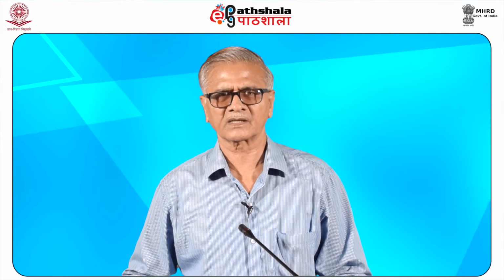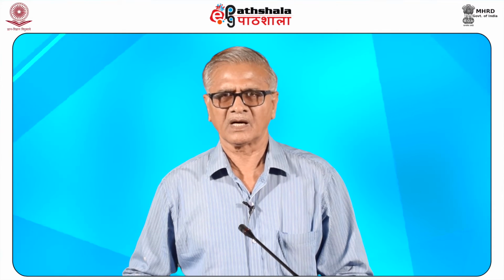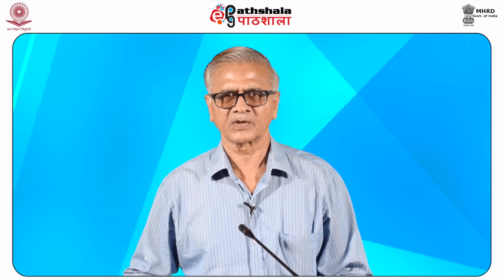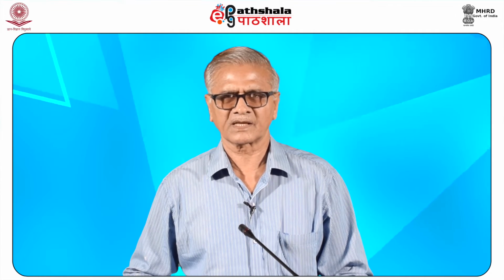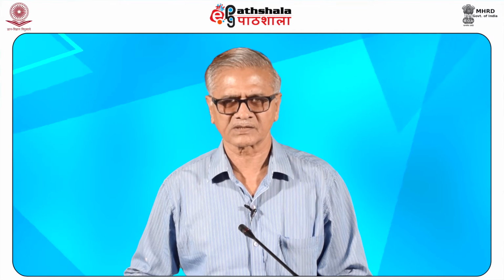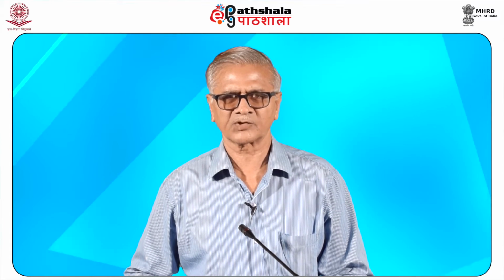The Sanger and Gilbert methods of sequencing DNA are often called first generation sequencing because they were the first to be developed. Developed in the late 1990s, new methods called second generation sequencing methods, that were faster and cheaper, began to be developed.